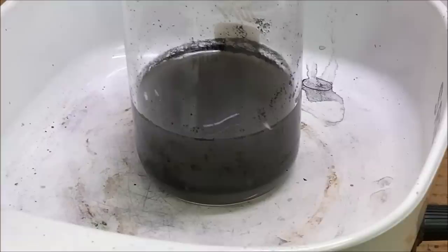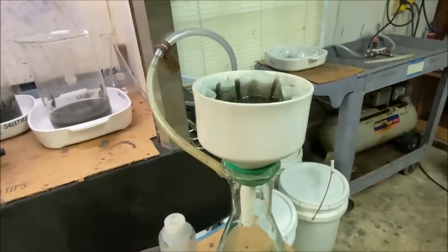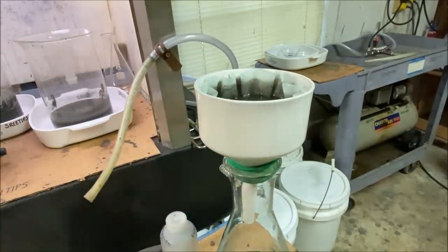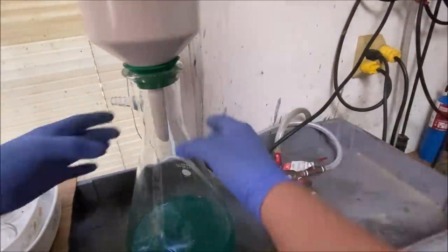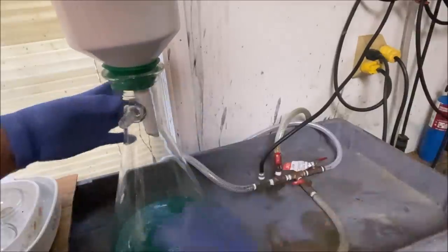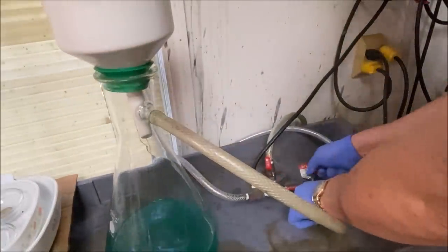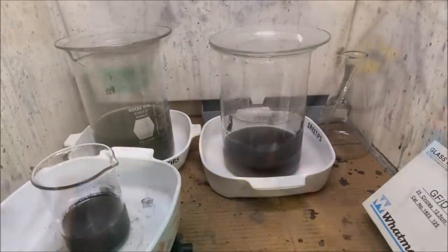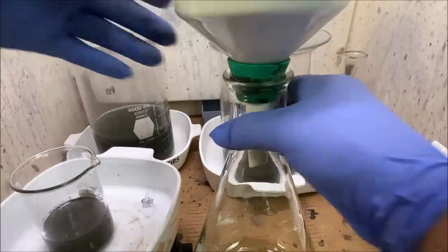Here's our material that we treated with the piranha solution. I need to attempt to filter it now. So what I'll do is I need this filter tube. I'll move this flask over to the filter table over here. I've got two tubes that I can use, fortunately. Here we go. We're going to try to filter our solution now. It's got some sulfuric acid in it.